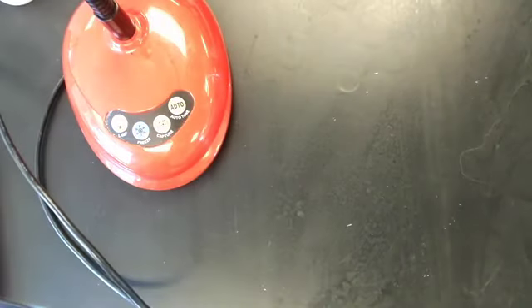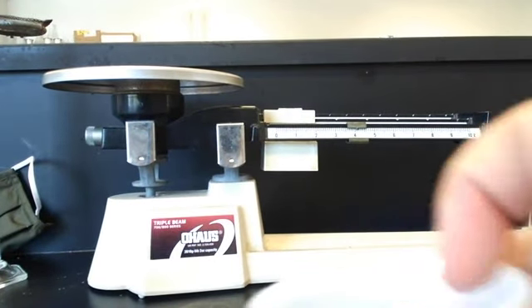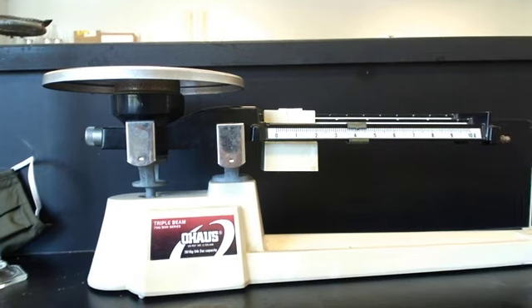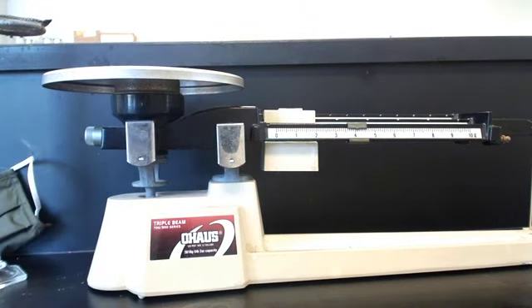All right, I didn't do this. So what we're going to do instead is we already know the mass of the cup is 3.6. So I'm just going to take a handful of beads.